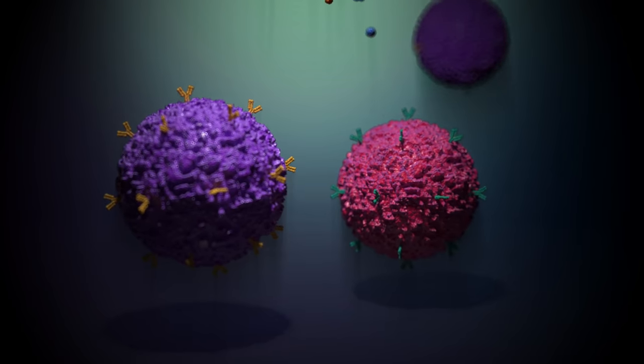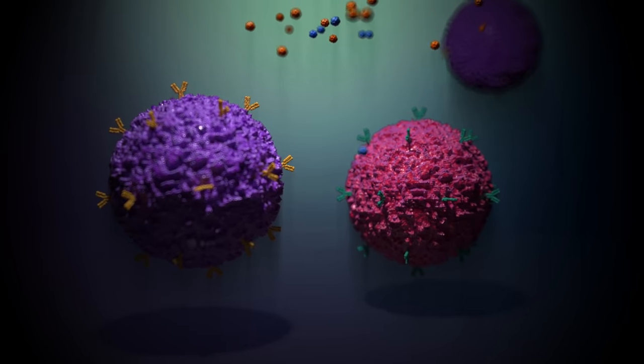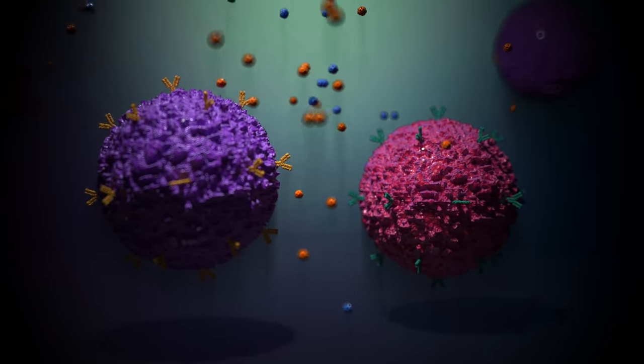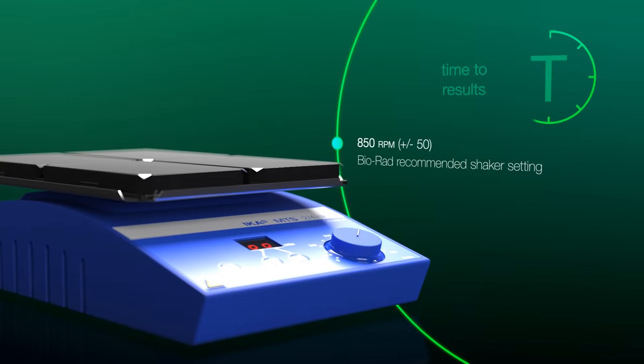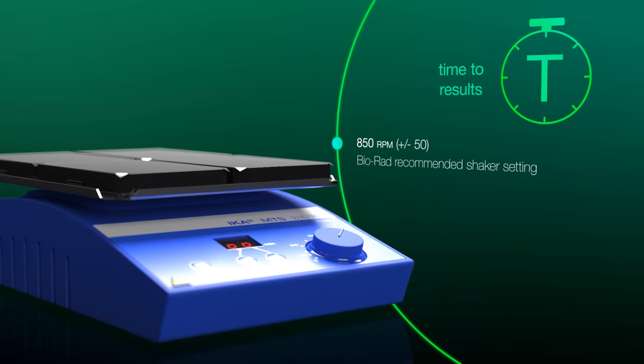During assay development, high-specificity antibody pairs are vetted so that you can multiplex at high-plex levels, reducing plates or runs, shortening incubation times and getting to a result faster.